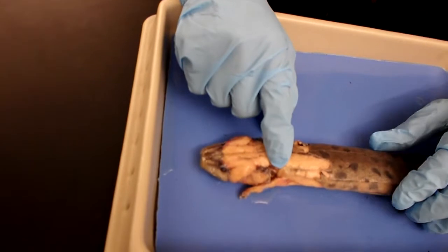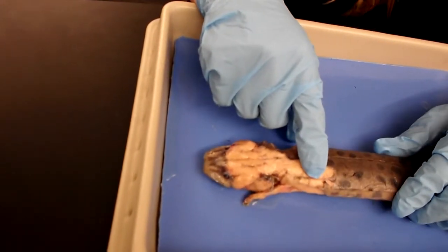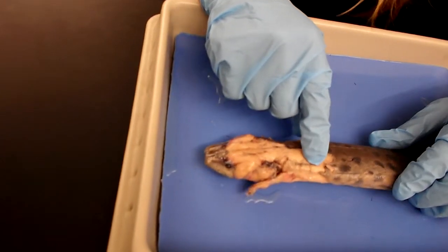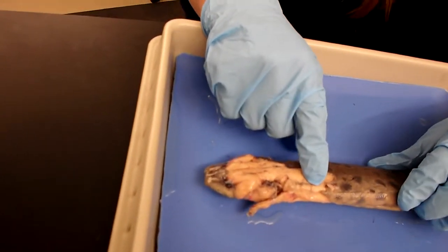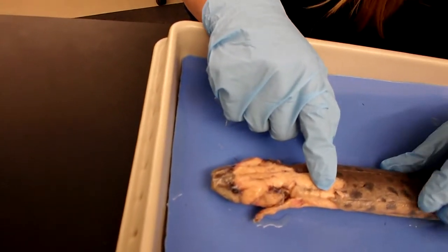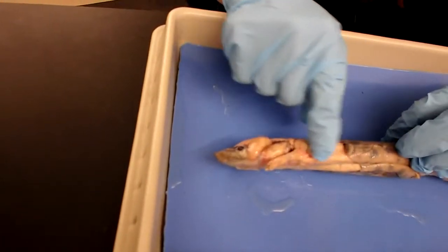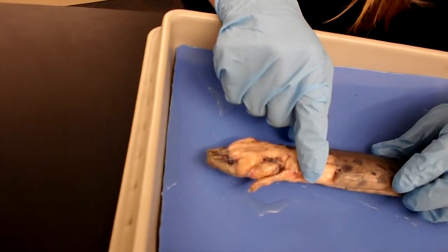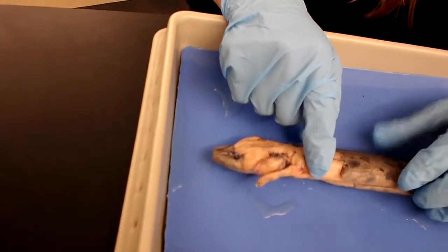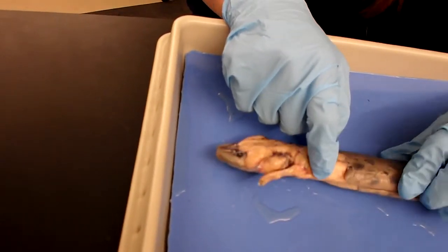And over here we have the dorsalis trunci. These originate at the transverse processes of vertebrae and myocepta and insert at the transverse processes of vertebrae and myocepta. The external obliques down here, shown right here, originate at the transverse processes of vertebrae and insert at the connective tissue of rectus abdominis.